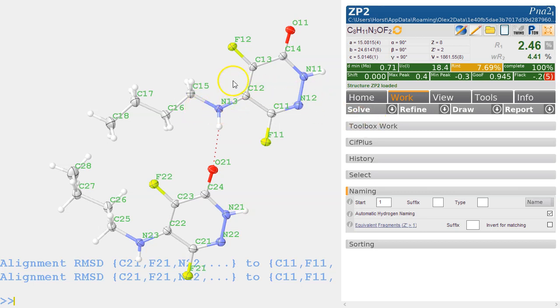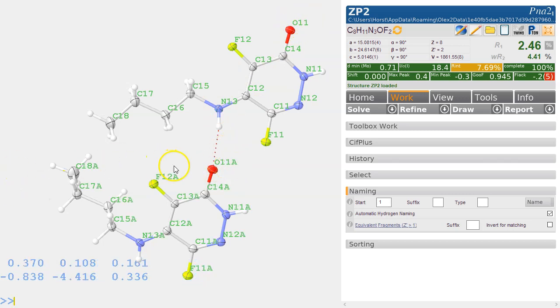One option is to transfer this naming scheme of this molecule onto that molecule. I'm clicking on one atom in this, on any one atom, it doesn't matter which one. The command is match -n because you want to play with the name. Any letter you type now or any symbol you type now will become a suffix. This here will become O11, so it will be O11 followed by A. This is O11A, and now this is of course O11.